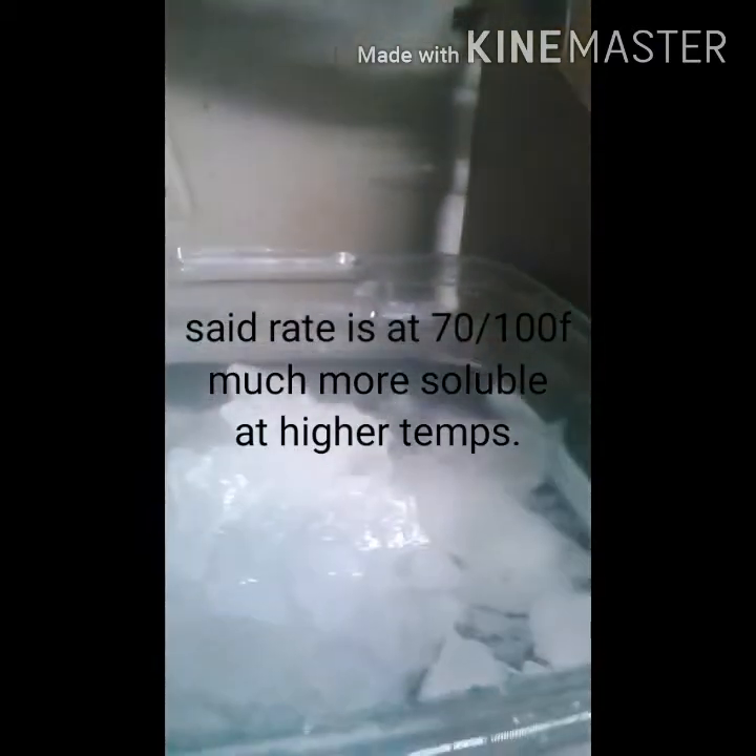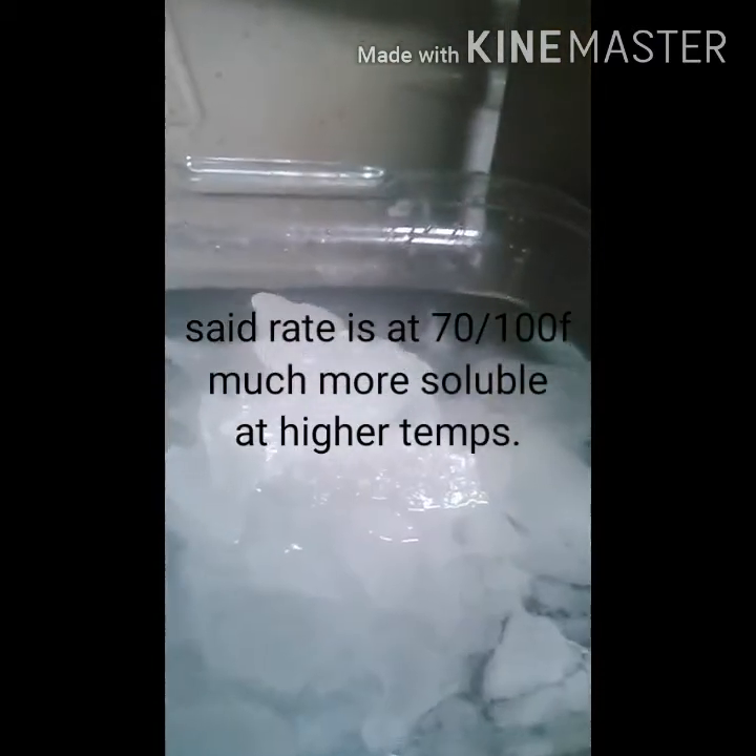Alright, so there it is. Now what I'm going to do is — it dissolves at 1 gram to 1 milliliter of water — so I'm going to heat it up, dissolve it, and filter it. I'll probably do that two or three times: one, to filter the particulates out, and two, to help get the remaining sulfuric acid, nitric acid, or any acid that's in there out. Once I get to the filtering part, I'll be right back.